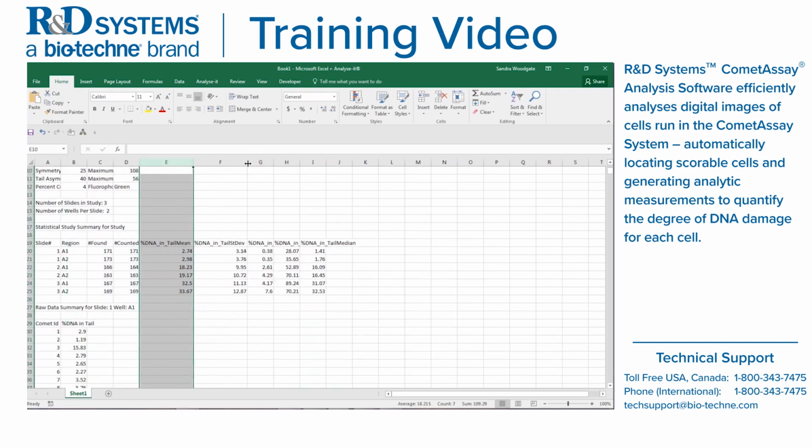We chose to export percent DNA in the tail. For the summary statistics, you have it for each slide and each well. It shows the number of comets initially found by the scanning software. The number counted is the number after you have completed editing, because you may have excluded some of the cells. Since we only selected percent DNA in the tail, you'll get the mean, the standard deviation, the minimum, the maximum, and the median for that well.